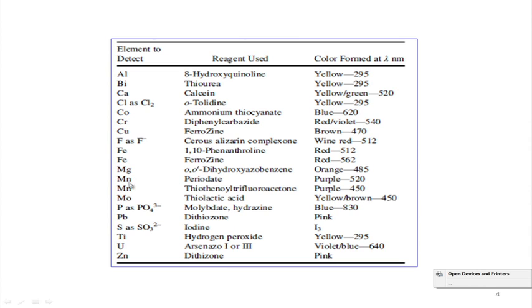This manganese ion is there, and the periodate oxidizes this manganese to permanganate ion. That is why the color written on the right hand side is purple, and this purple color is nothing but the formation of the permanganate ion, which absorbs at 520 nanometer. So, the next day we will consider how, in a solution with permanganate ion, or dichromate ion coming from chromium, we can detect it with the help of a spectrometer, visually, by the use of absorption spectrophotometry. Okay. Thank you very much.